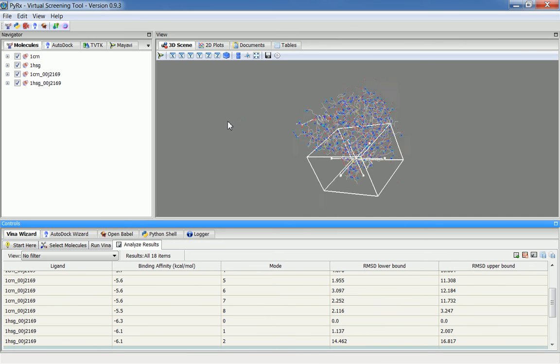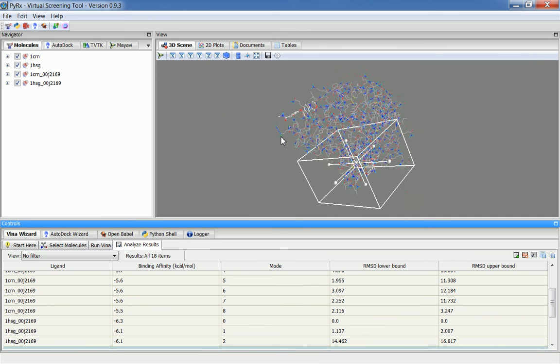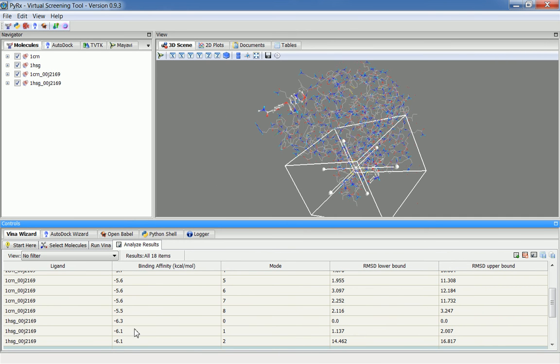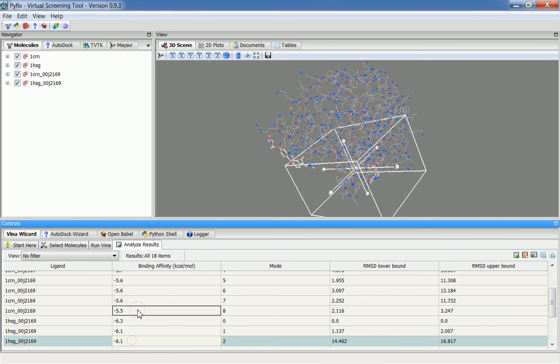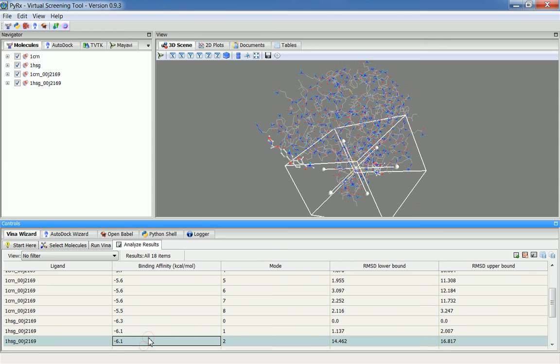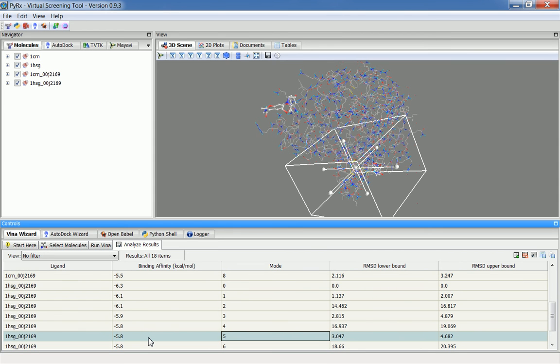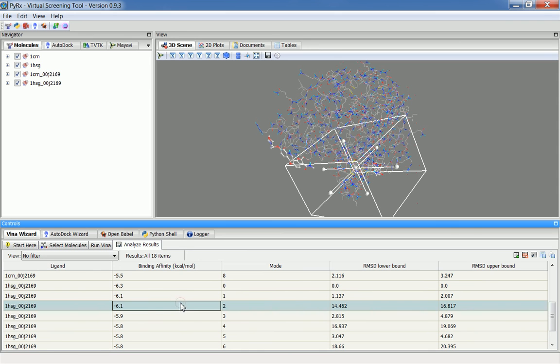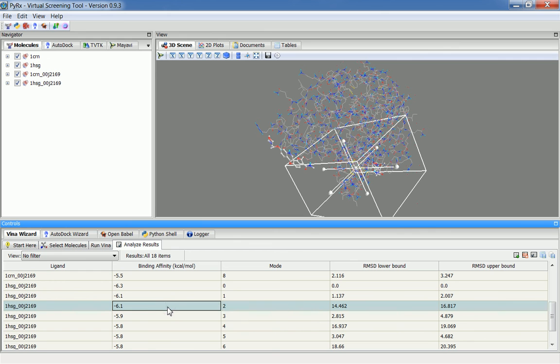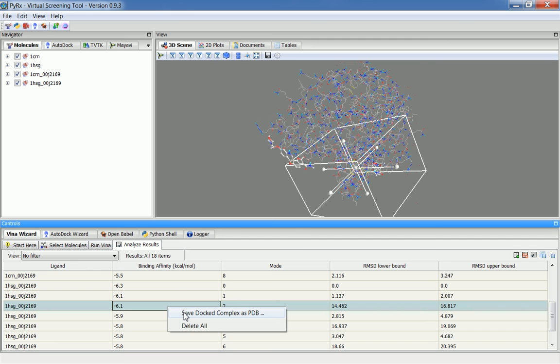I'll zoom in here so we can see better. When I go through different docked conformations, it will show me where this ligand is bound to. Also new in this version is an option to save docked complex as PDB. I right-click on this row, and now I have this option to save as PDB, this complex. This is useful if you want to visualize this docked result with other molecular visualization software.